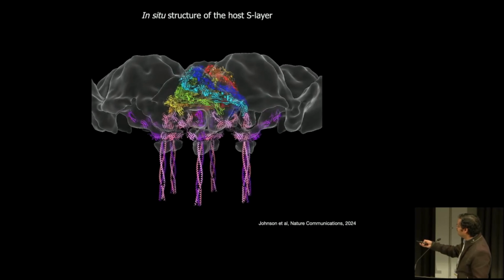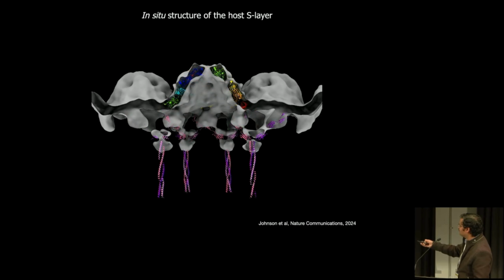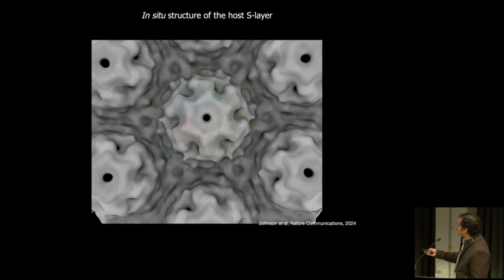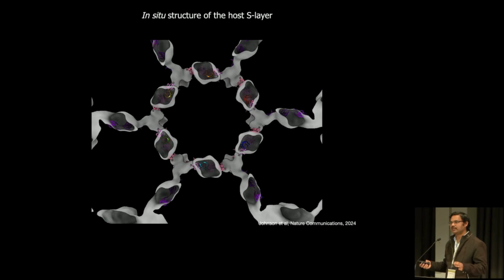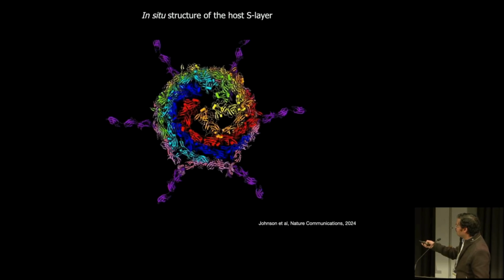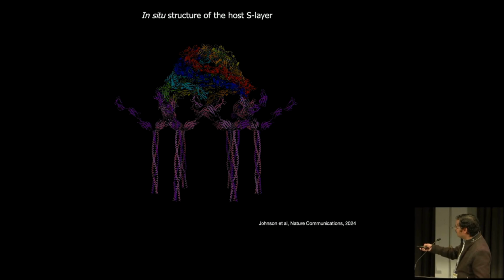And then these are other proteins. The purple proteins are basically SLA-B. So trimers of SLA-B would connect to this dome-like structure, and each of these SLA-B would then interact with 3 other domes. And that shows the fitting of this model into this density map, and that gave us a pseudoatomic model of the S layer of this host. So you can see now overall how each of the domes looks. And then these connections are basically connecting to the host cytoplasm.